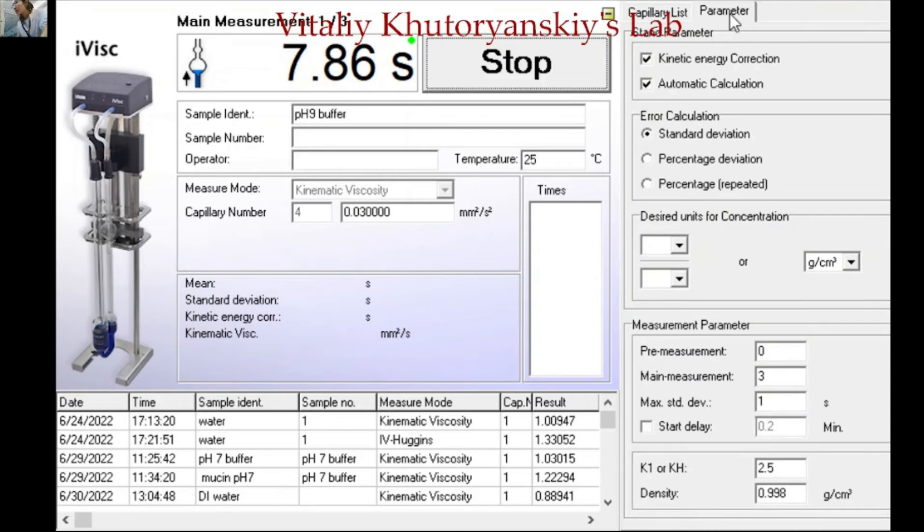From the measurement parameters section, it will show whether you need a pre-measurement. Currently we have not set a pre-measurement, but if you need it, you can set how many times after this measurement — for example, two or three times, as many as you need. For the mean measurement, set it to at least three times, and it will also give you the standard deviation.